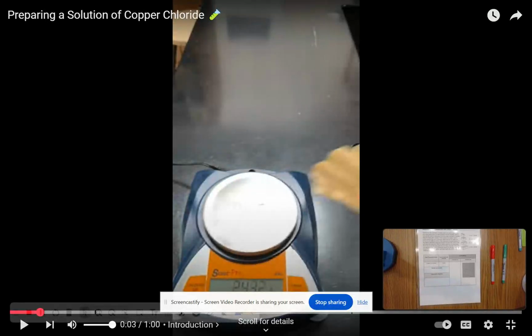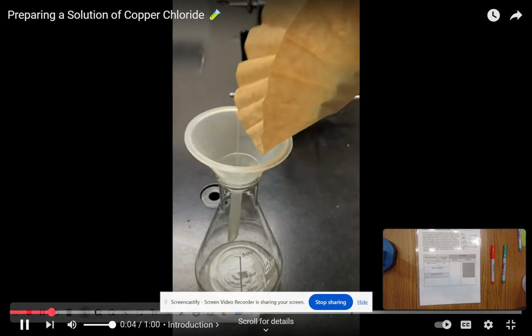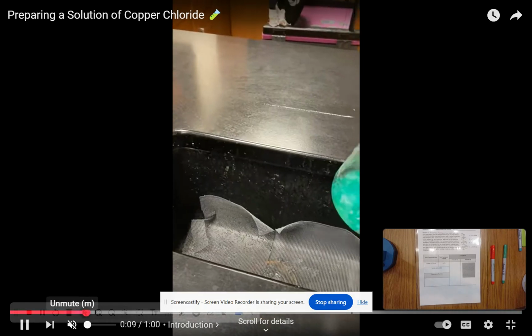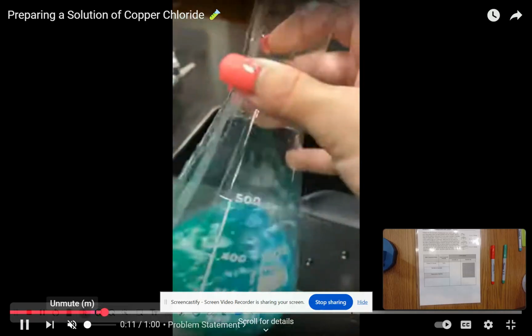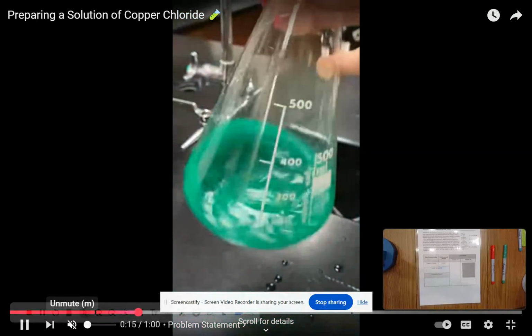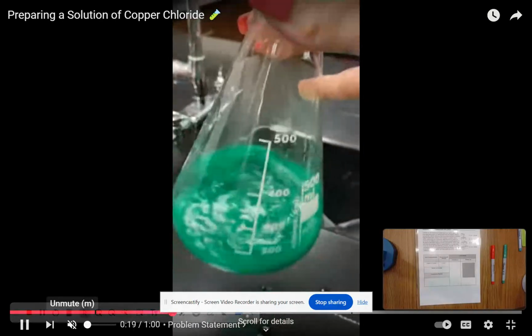Okay, so we are going to look at putting another ionic compound into water. In this case, I'm going to start playing the video. So they are taking copper 2 chloride solid, and she is adding water to her flask and stirring.